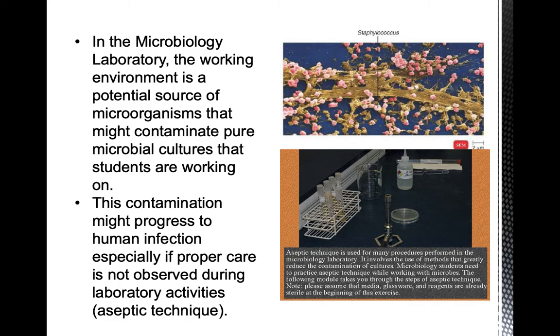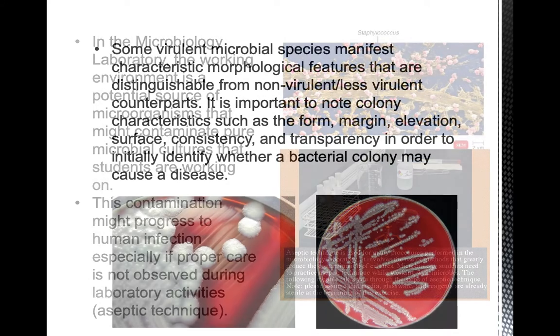So I hope that by now we can, from time to time, go back and review that, and by now we're familiar with the basic aseptic technique. If aseptic technique is not executed well while you are working on your microbial cultures, they can transfer to your clothing, your body parts, and you might not know it. You have taken them home with you after you leave the laboratory, and they may cause infection if uncontrolled.